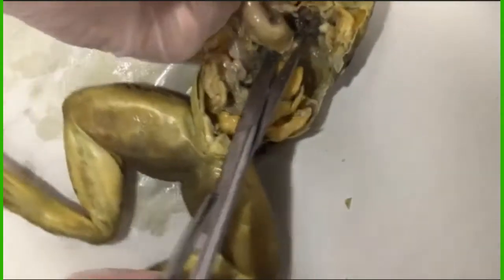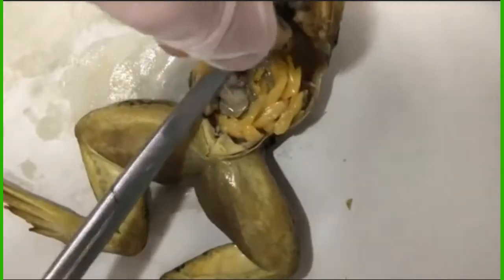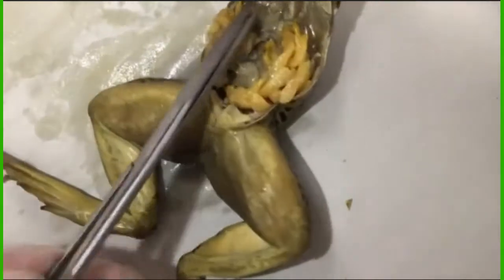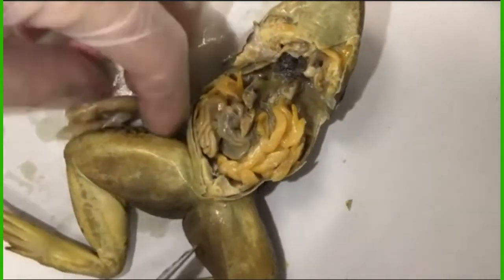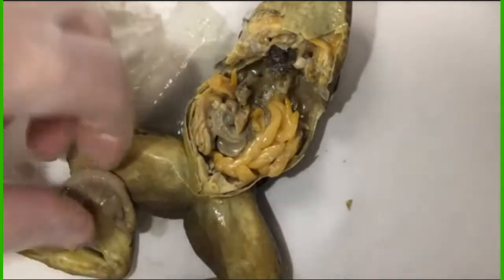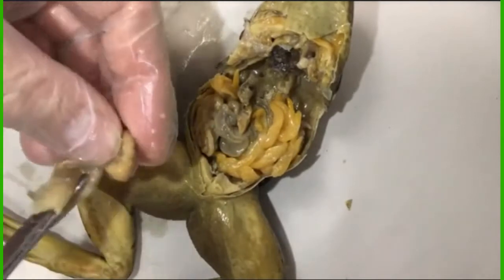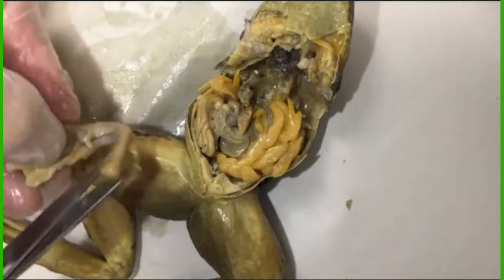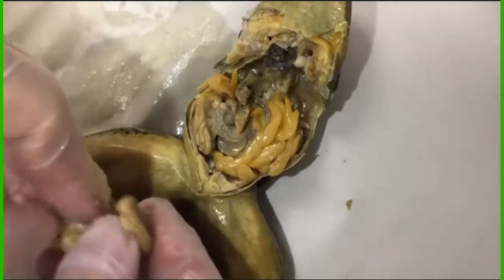All right. Now we're getting underneath that stomach and cutting it right at the very short esophagus. It barely has any esophagus, just almost at the back of the throat, attached to the top of the stomach. And then right at the base of the small intestine, that's the other part. I'm going to cut it longitudinally, in other words, lengthwise, so that we can see inside.